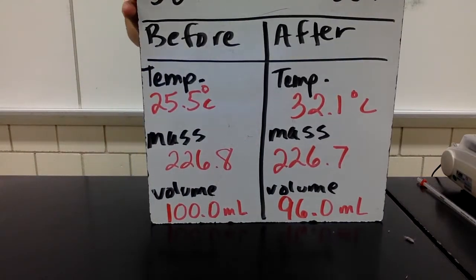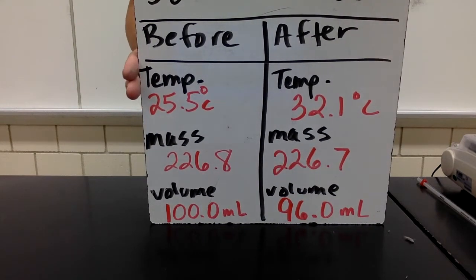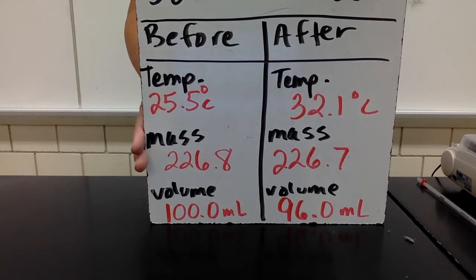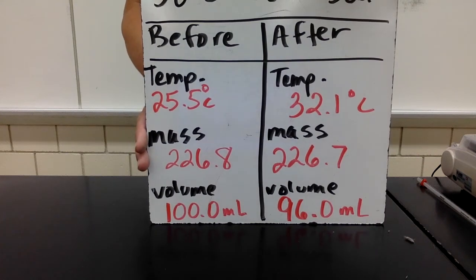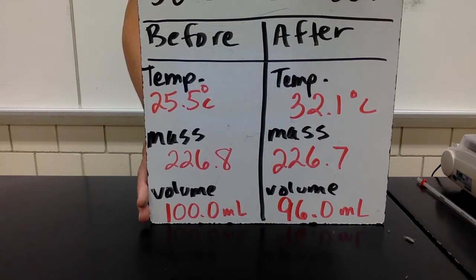So to review, before we mixed the two liquids, the ethanol and the water, I took the temperature of them both. They were room temperature, about 25.5 degrees Celsius. I put the whole graduated cylinder with both liquids in it onto the balance, and I got a mass of 226.8 grams. And then I read the volume after I layered the ethanol on top of the water, and I got a total volume of 100 milliliters, which makes sense because I added 50 milliliters of ethanol to 50 milliliters of water.